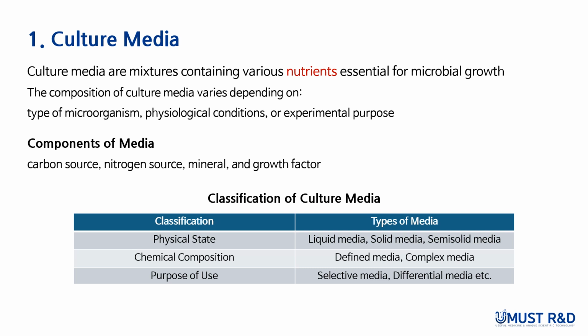Culture media are mixtures containing various nutrients necessary for microbial growth. The composition of media varies depending on the type of microorganism, cultivation conditions, and experimental purpose. Basic components of culture media include carbon source, nitrogen source, minerals, and growth factors.